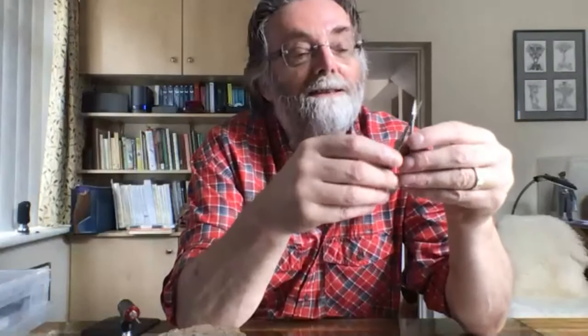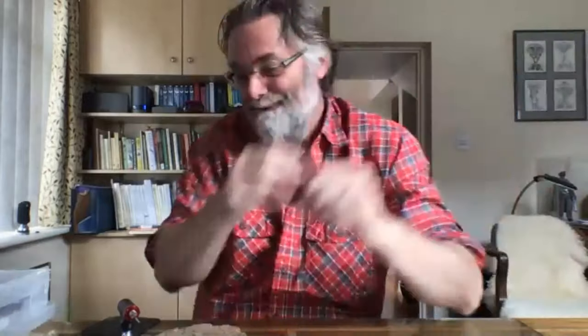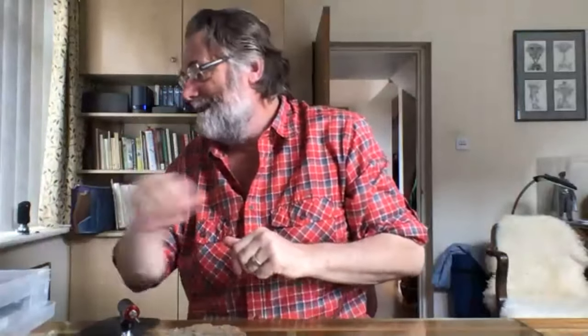If you get some nice fluorescent day-glow ones it means you're less likely to lose them when you put them down somewhere. They're less likely to go walkies at Microscope Club.